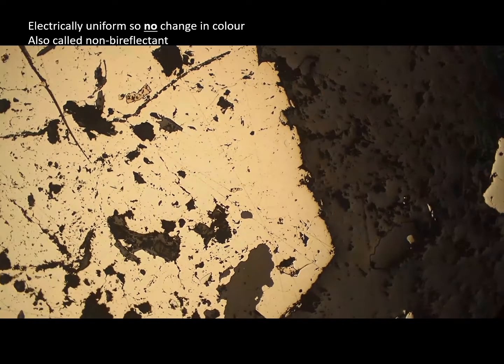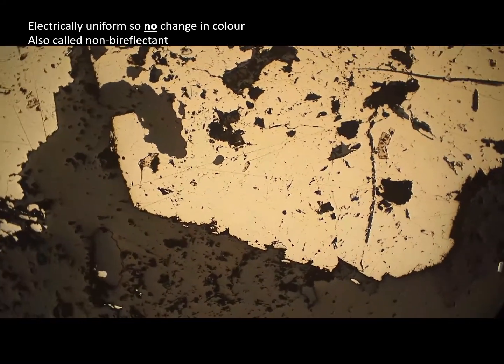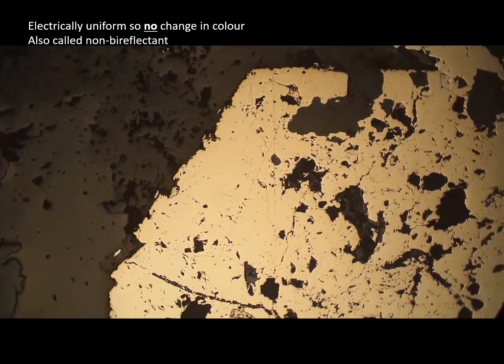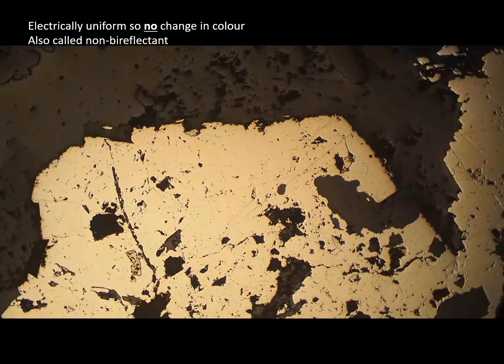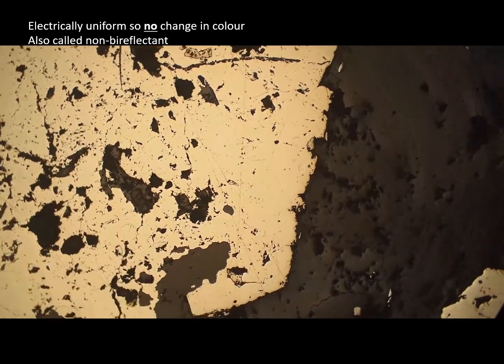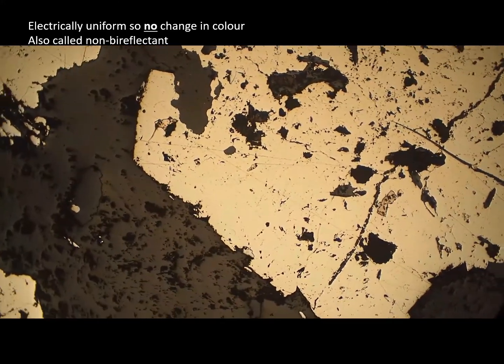We're going to start rotating the stage, and it is clearly not changing. This is just showing how our pyrite is going to look under a microscope, and if it was not electrically uniform, it would be changing colors as we rotate the stage.